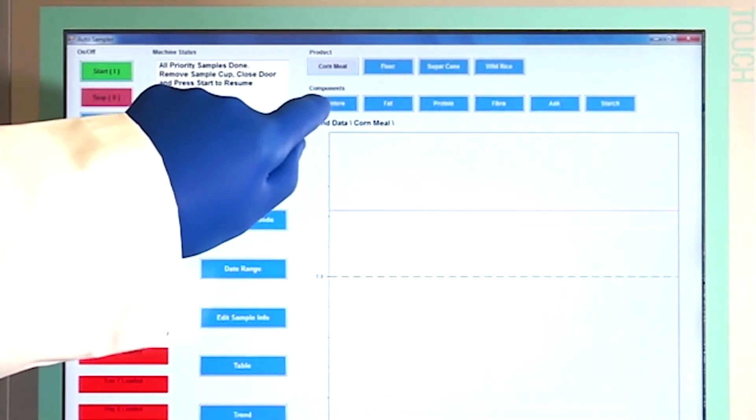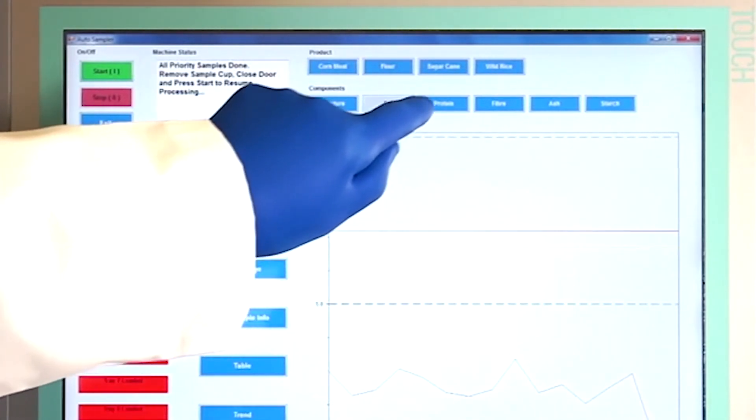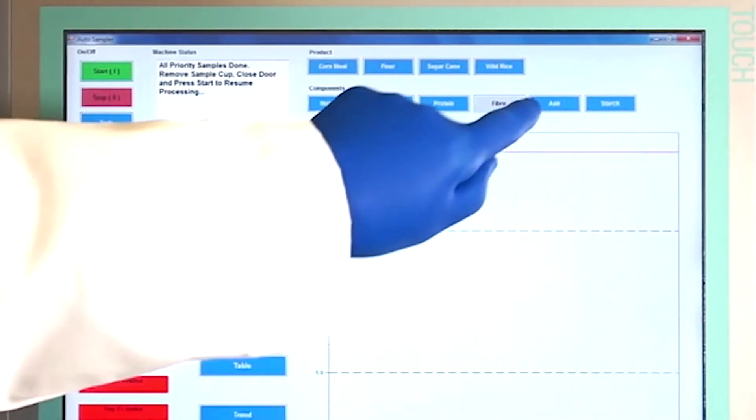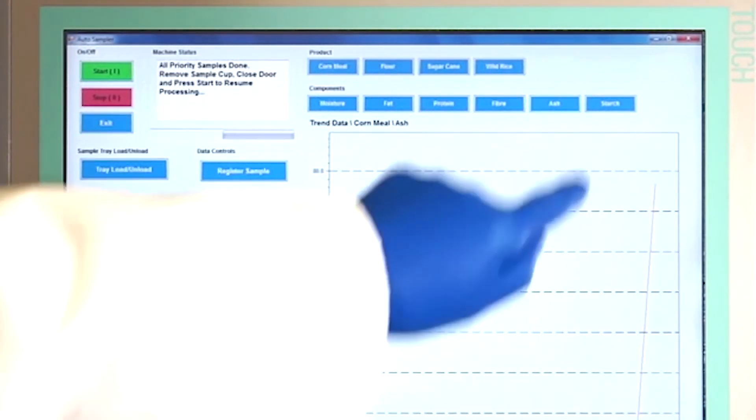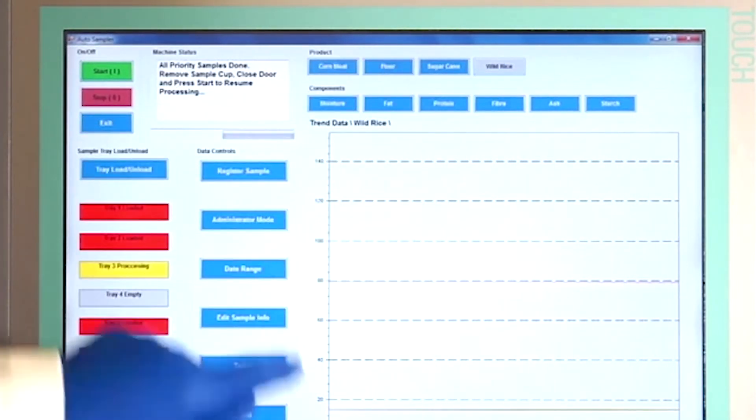NIR Spectra parameters and analysis results are written to an industry standard SQL database, providing easy extraction of analysis results to Excel or a variety of third-party dashboard programs to evaluate quality, consistency and homogeneity of incoming materials and finished products.